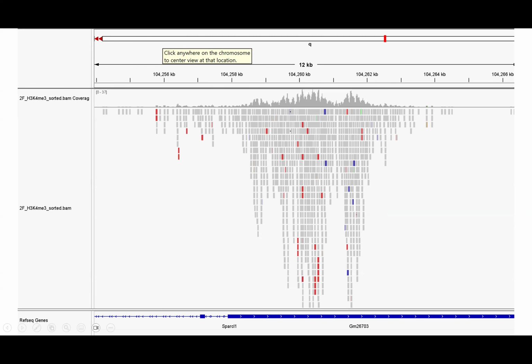For BAM files, it'll show you two sort of views. So one is what it calls the BAM file here, where you have the actual sequencing reads, and it's where they kind of lined up. So you can see these sort of stack over different regions, and the colors denote different mismatches between the reads and the reference. So you can see there's some, but in general, a good degree of alignment.